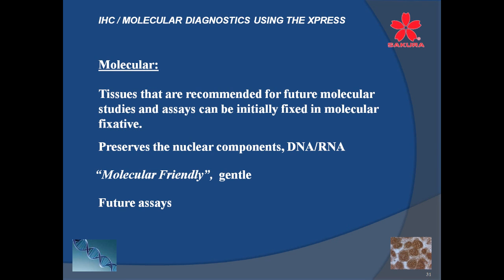Histotechnologists have really been in a molecular mode for a while, believe it or not. We were the forerunners of some molecular work because we used to do the MGP stain, methyl green pyronin. We would fix the tonsil and adenoids, preserve them, and then stain with methyl green pyronin to see the RNA and DNA.